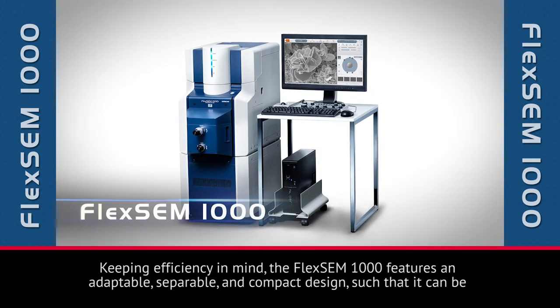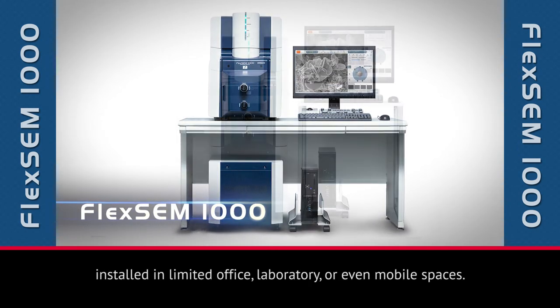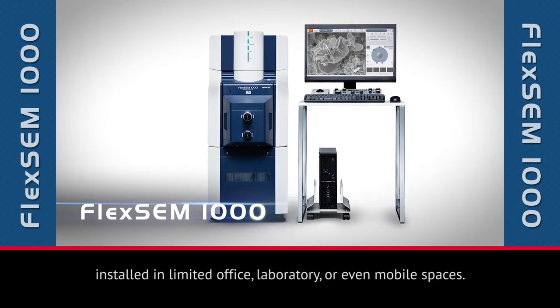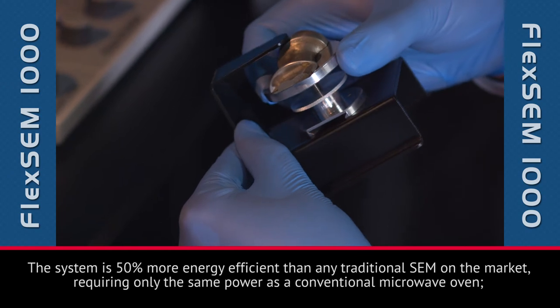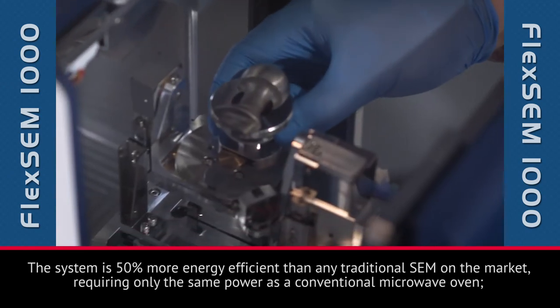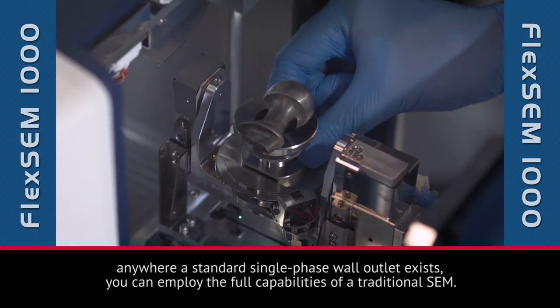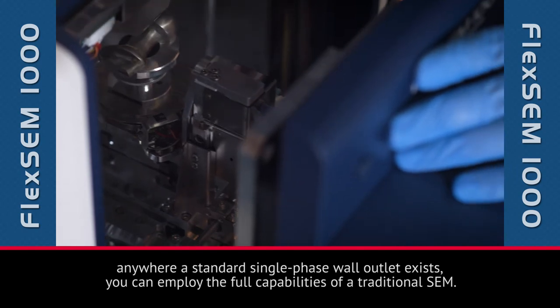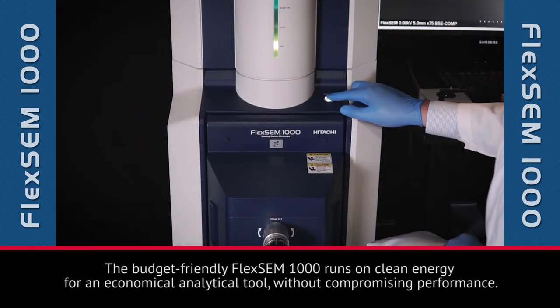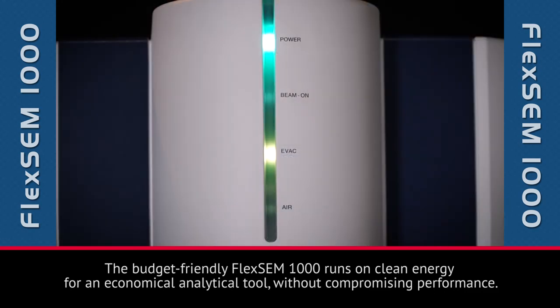Keeping efficiency in mind, the FlexSEM 1000 features an adaptable, separable, and compact design, such that it can be installed in limited office, laboratory, or even mobile spaces. The system is 50% more energy efficient than any traditional SEM on the market, requiring only the same power as a conventional microwave oven. Anywhere a standard single-phase wall outlet exists, you can employ the full capabilities of a traditional SEM.